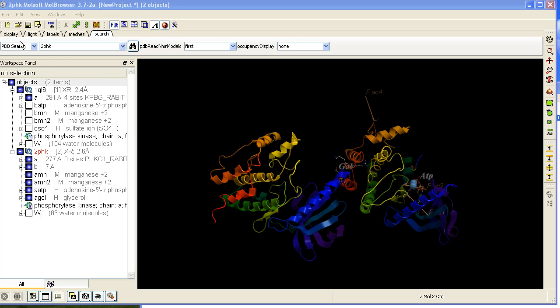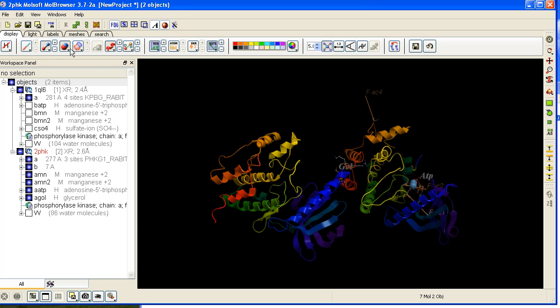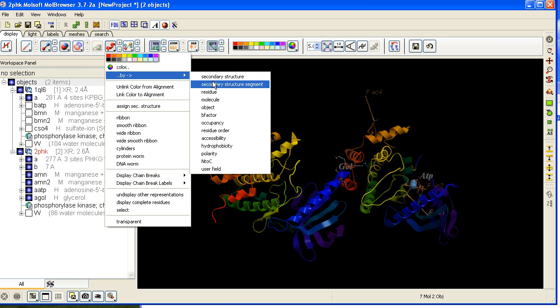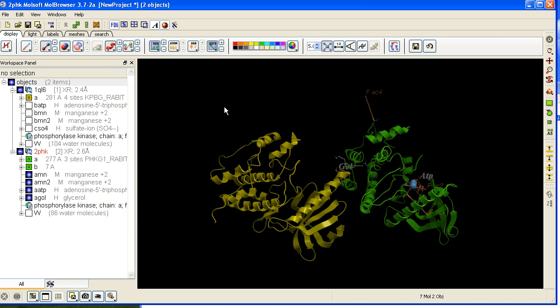For clarity we will display each object in a different color. Color by object. So 1QL6 is colored yellow, 2PHK is colored green in ribbon.